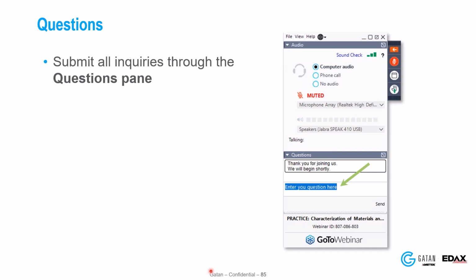As far as polishing techniques, the most recommended technique for magnesium is ion beam based preparation. We use our PEX tool. Michael Hasselshire was our product manager for specimen prep and did a lot of work with the groups at Oxford University and Imperial College in the UK, who looked at a lot of magnesium and zirconium alloys, these reactive alloys, and developed recipes to use broad ion beams on these materials.